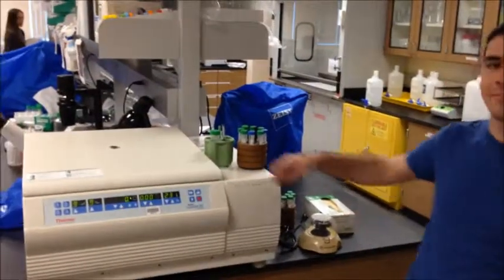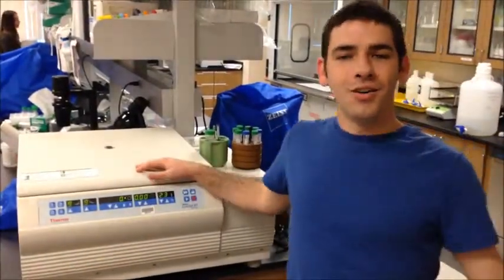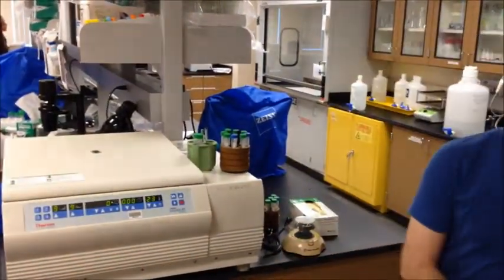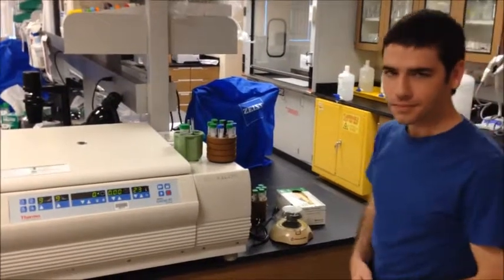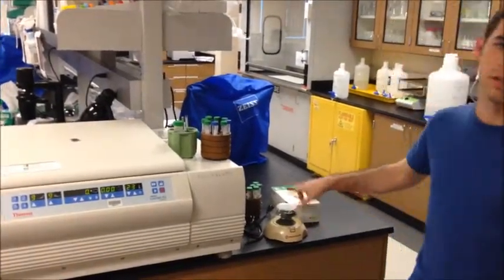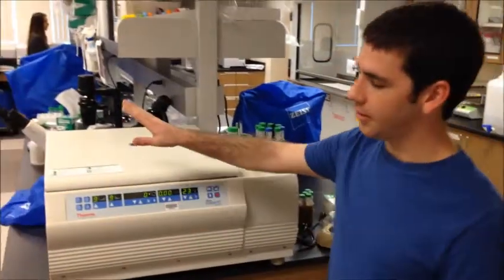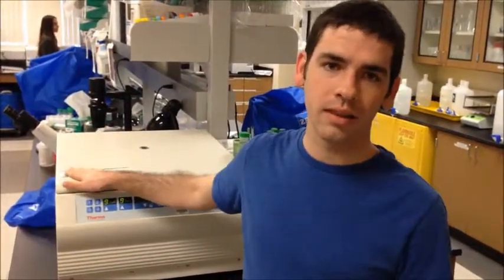Exactly. Okay, I understand. So an analytical centrifuge would be a smaller scale, one like this. And a preparative centrifuge would be a bigger one like this. So you can centrifuge larger and more centrifuge tubes.